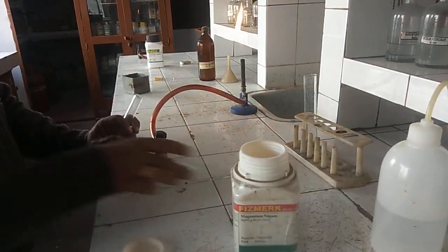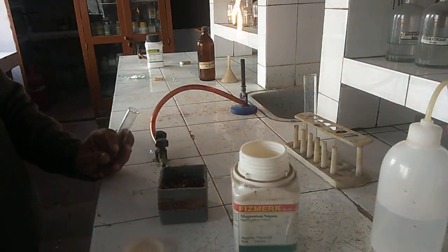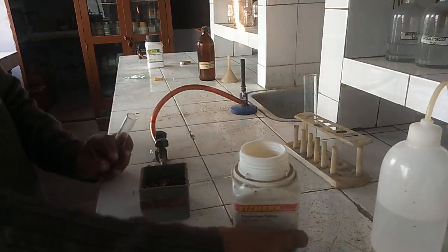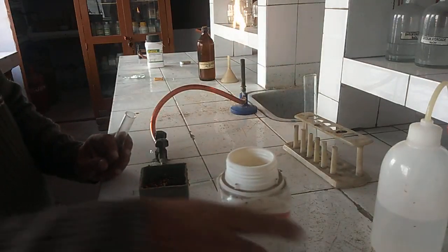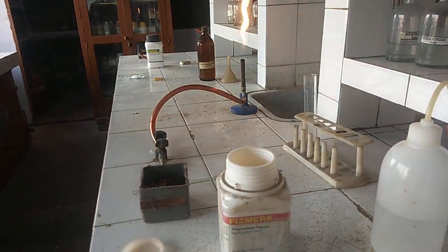Move on to another acidic radical, which is nitrate. Nitrate is NO3 minus. That means it is the anionic part of the salt. Now we will see the presence of nitrate ion in magnesium nitrate. We have the salt of magnesium nitrate and we will check the presence of nitrate ion. As nitrate ion also belongs to group 2 of acidic radicals, we have to test this acidic radical with the help of concentrated H2SO4.